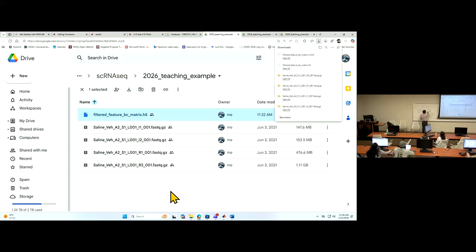So Cell Ranger will export a set of standard H5 files. And this is filtered feature. Feature means gene expression, gene, and the matrix H5. This file, the download, and you know it's in the download folder, okay? If you don't have this, refresh your web page. You should have this. I just uploaded them.